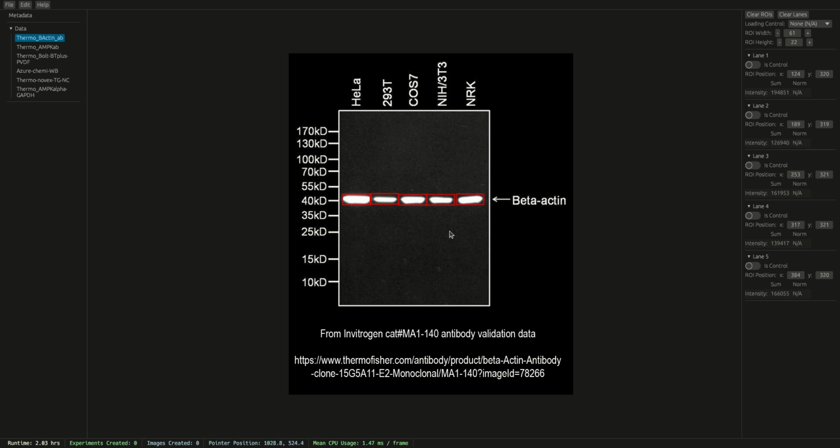This is a pretty good state, but let's say on this first band, it seems a little tight. In the tool panel on the right, I can increase the width of my bands globally. This action applies to all bands at once.